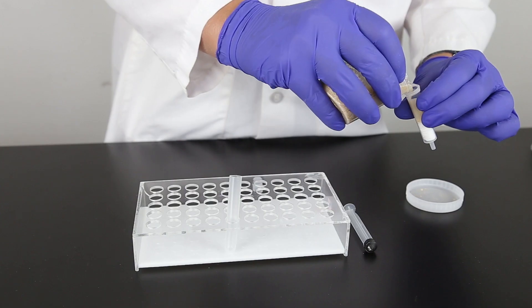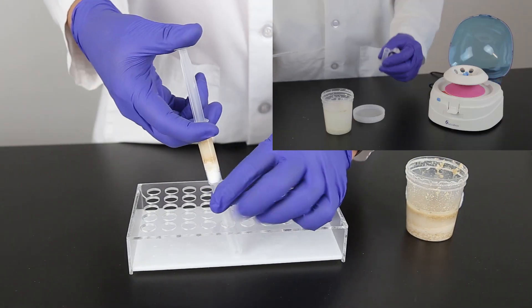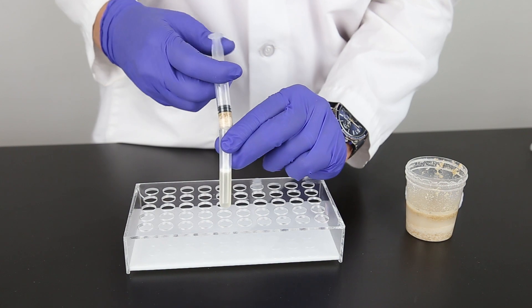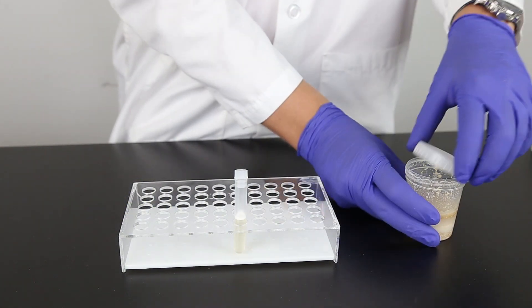Allow the sample to settle and filter with a filter syringe or Wattman number 4 filter paper. You can also pipette the sample into a two milliliter microcentrifuge tube and centrifuge for 30 seconds. It is important to collect at least three milliliters of filtrate through a single filter syringe for optimal sample accuracy.